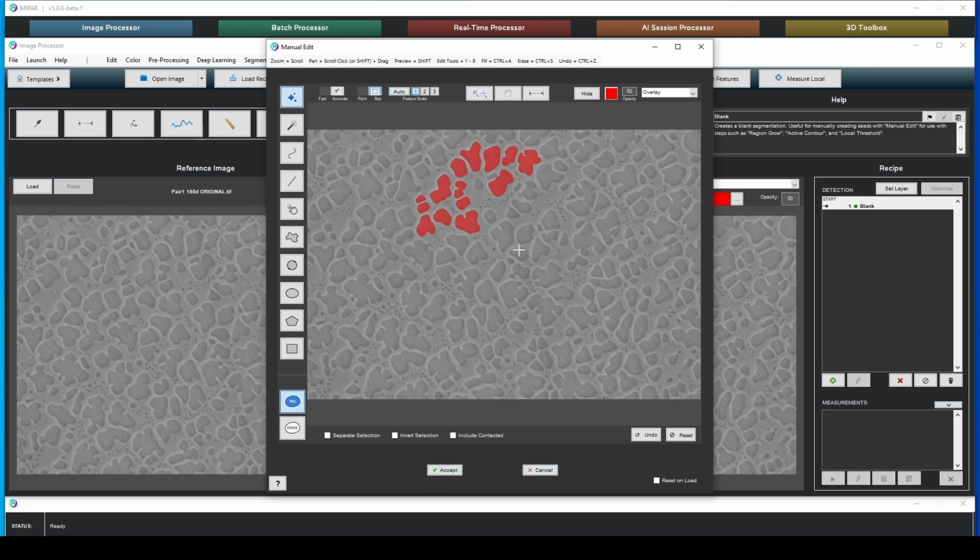Our box works in a very similar way to the custom seed point box, where these seed points are really a bit more custom. We can go in and adjust the size of our window for Spotlight to find objects where we are highlighting.